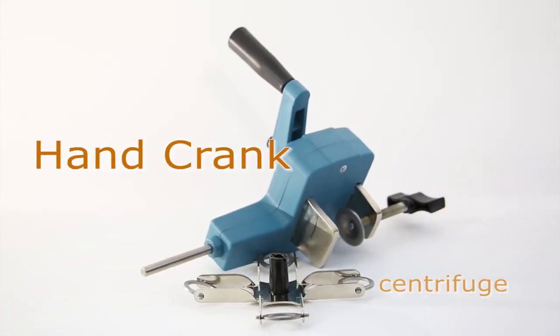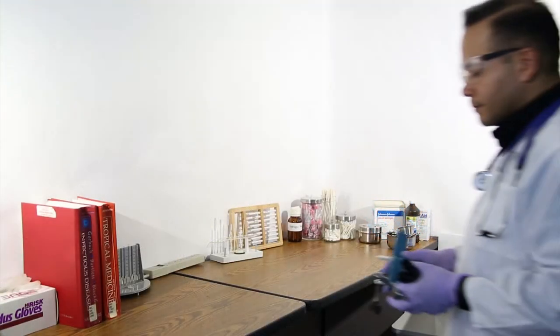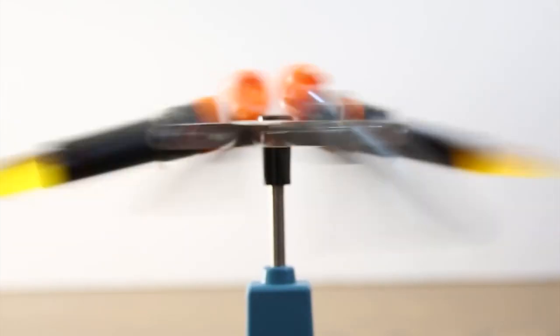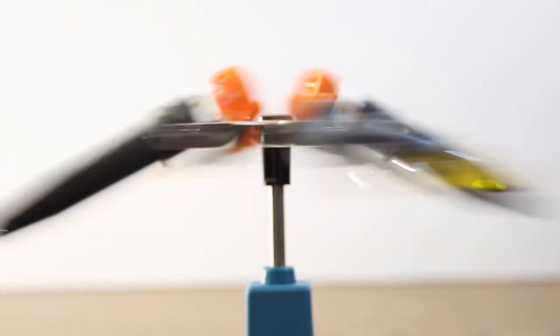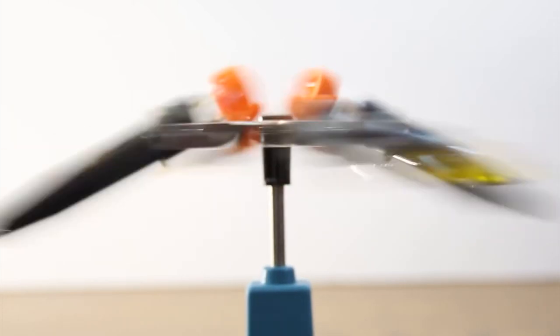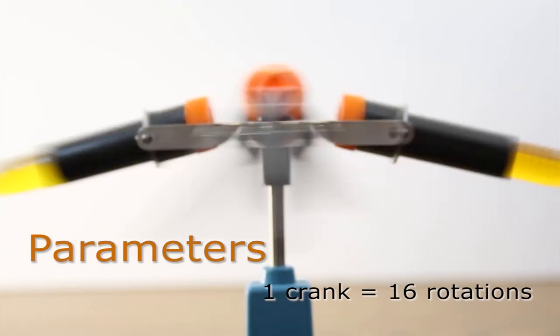Hand crank centrifuge. The hand crank centrifuge spins liquids up to 15 milliliters, such as urine and blood, and is operated by hand. The important factor when separating substances by centrifugation is the amount of force needed for separation without damaging the substances. Refer to the instruction manual for the amount of force and formula for calculation.